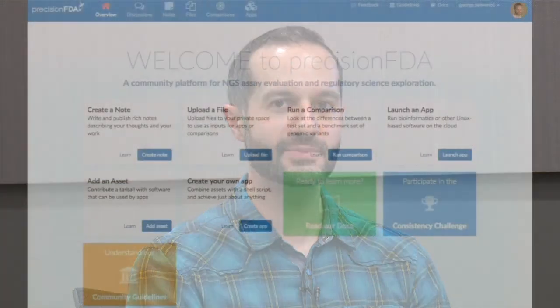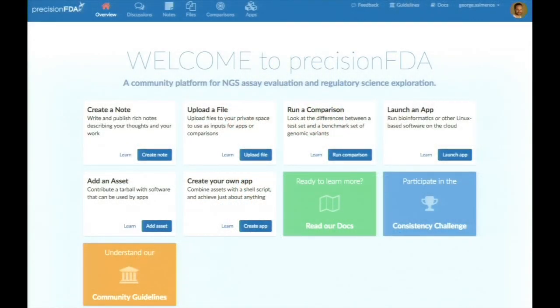When someone logs into PrecisionFDA, the welcome screen allows them to perform a few tasks and get familiar with the platform. At the top, you see there are different areas such as discussions, notes, files, comparisons, and apps highlighting the different features of PrecisionFDA.